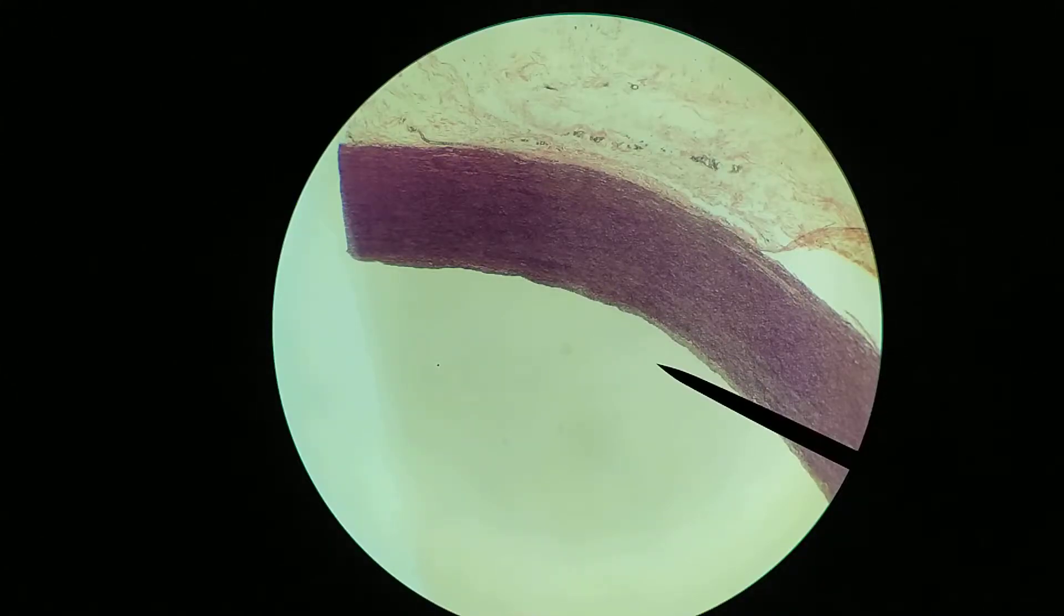Hi everyone, in this slide we will be looking at the human aorta. What I'm pointing to right now is the lumen of the blood vessel. So what you're seeing here is just the interior of the blood vessel.